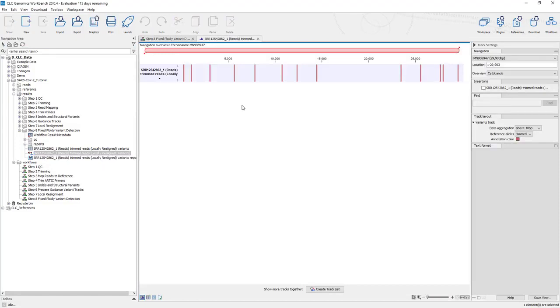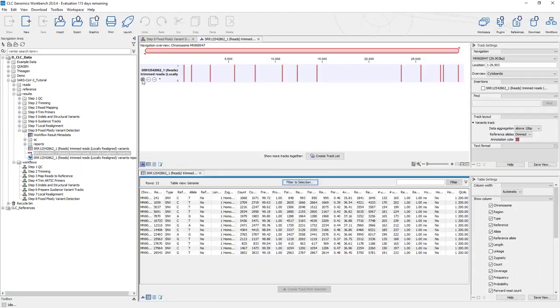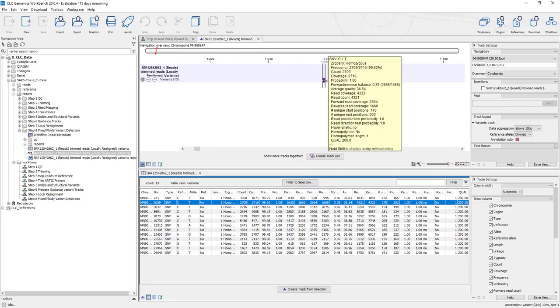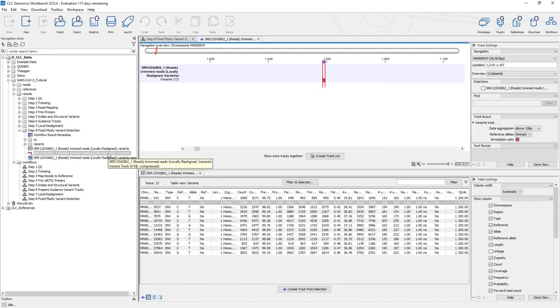Okay, this is our variant track. This is what's nice to look at, and you'll see more about this later when you have this variant track and you're using it with your genome or with your BAM alignments, because you can click this thing here, and then you'll see your list of variants with all the different parameters. I find this table extremely useful. It's very useful when we're comparing tracks at the end, where you'll get to see where your variant falls in the read mapping, so you could do some manual confirmation. But we will use this variant track for later.